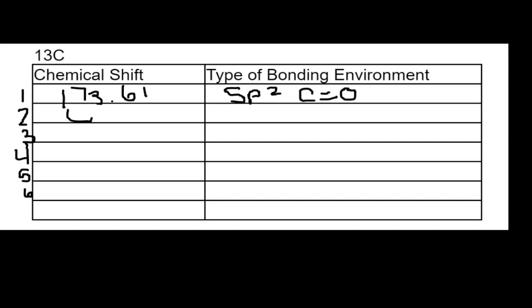Next we have 60.13, and that would be sp3, and that is the carbon that is bonded to the oxygen.